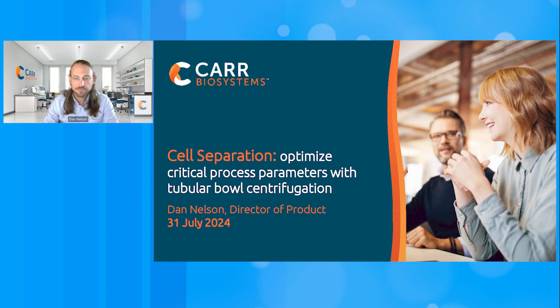We're going to be talking about cell separation, as you mentioned in the intro, and how critical process parameters can be tuned for your process goals across a variety of biomanufacturing workflows.